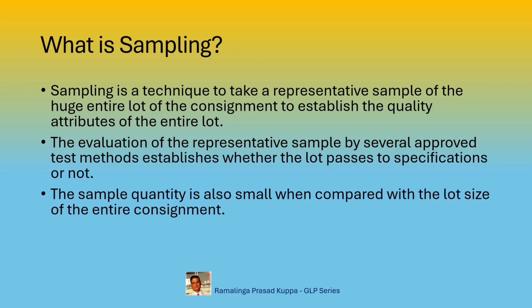The sample quantity is also small when compared with the lot size of the entire consignment. Imagine this situation. You are taking a few grams sample for evaluation from a huge lot of few hundred kilos or tons. So, how much care is required to take a representative sample?